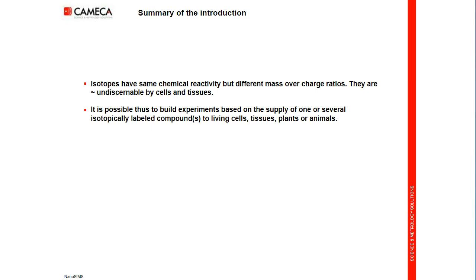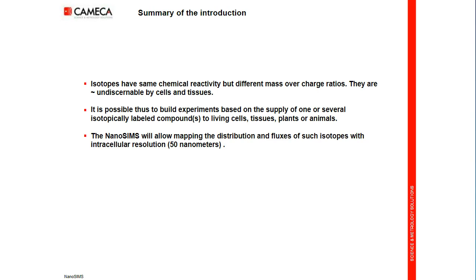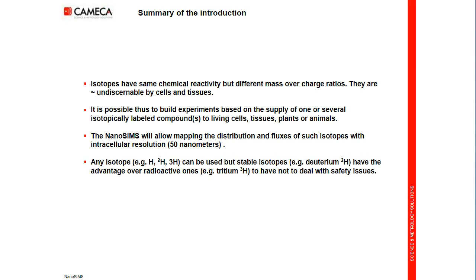The NanoSIMS will allow mapping the distribution of and fluxes of such isotopes with 50 nanometer resolution. And any isotope can be used, but stable isotopes like deuterium are advantageous over radioactive like tritium because they have not to deal with safety issues.